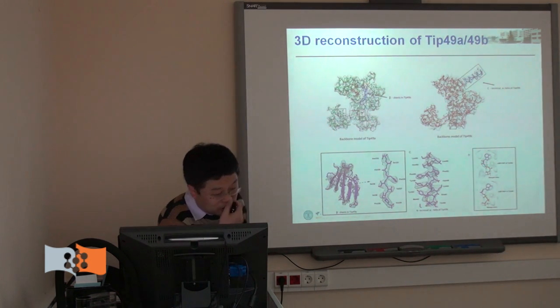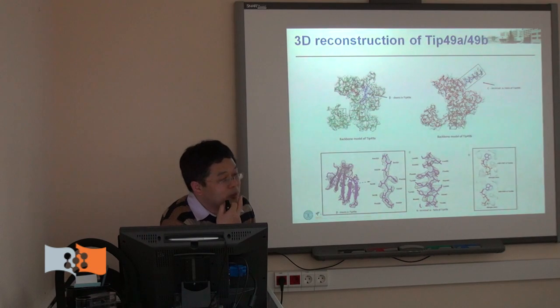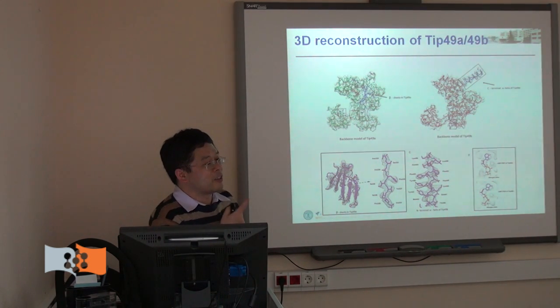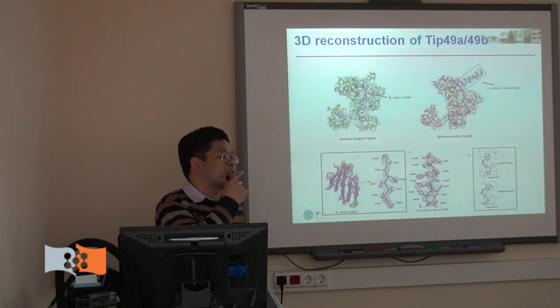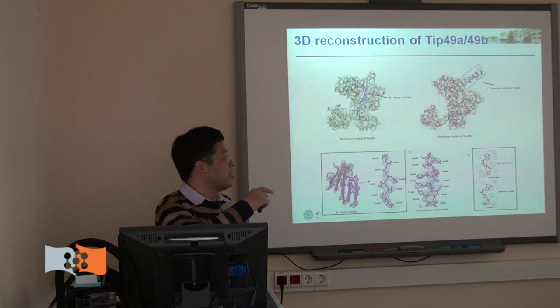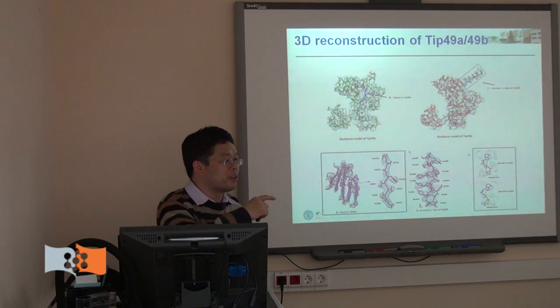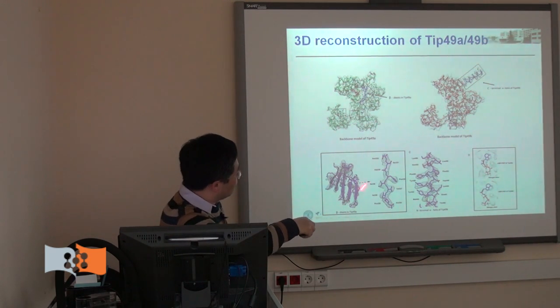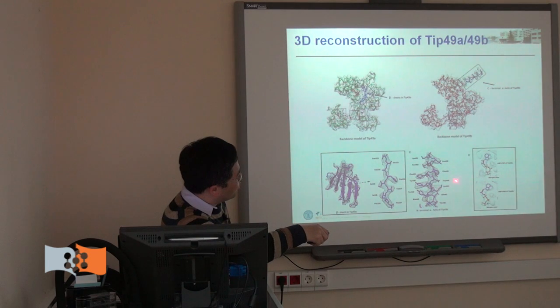As I mentioned, in the cryo-EM field we have done a lot of work on high-symmetry viruses. We can do near-atomic resolution. But this one, we think is reasonably good, but it's not only C6 symmetry. It's not a high symmetry, it's a low symmetry, but we still get this model built.